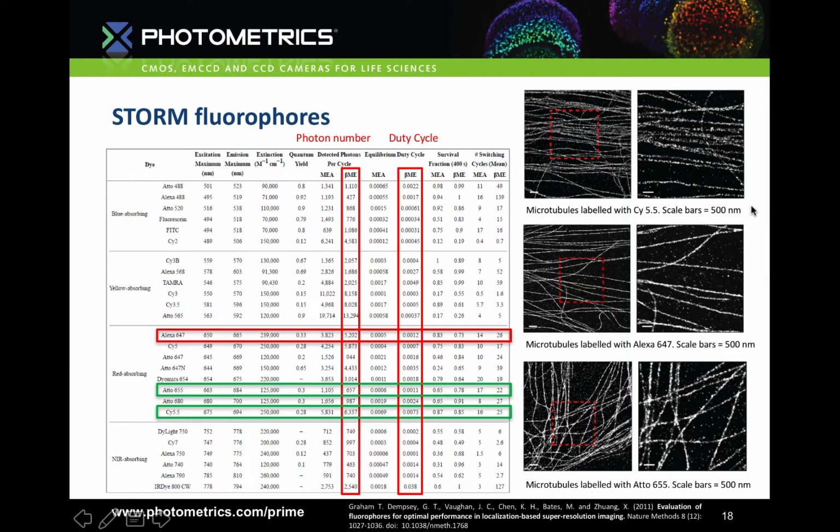But the most important thing to take away from this is that STORM is highly dependent on the physical properties of the dyes to get high quality super resolution data.